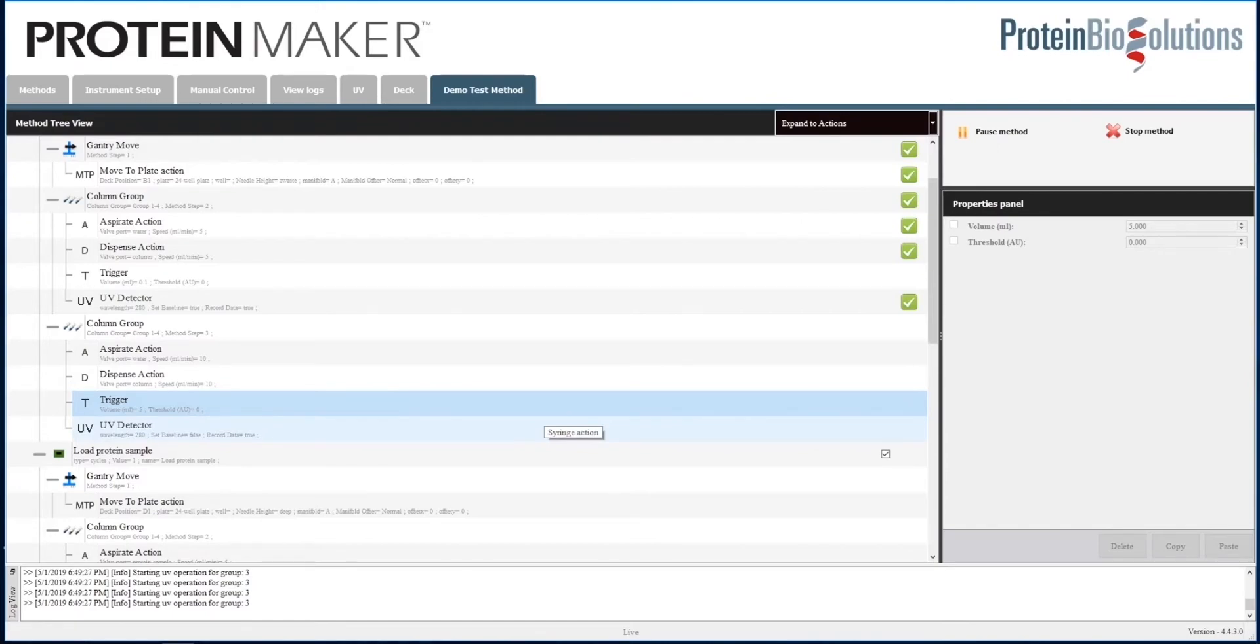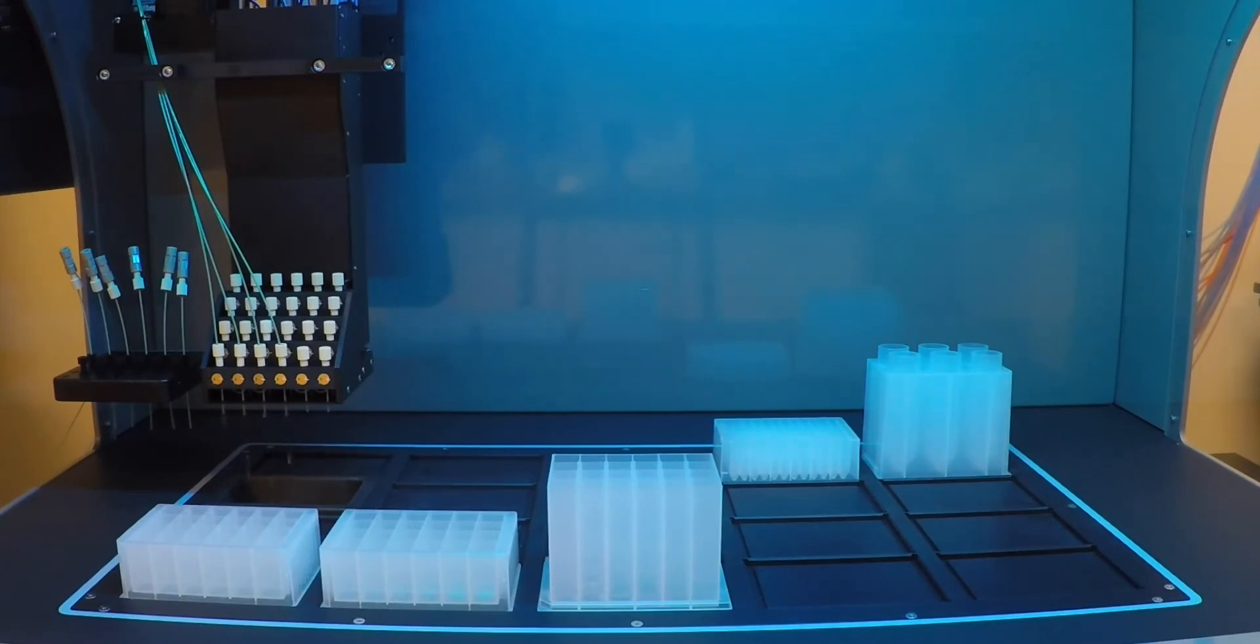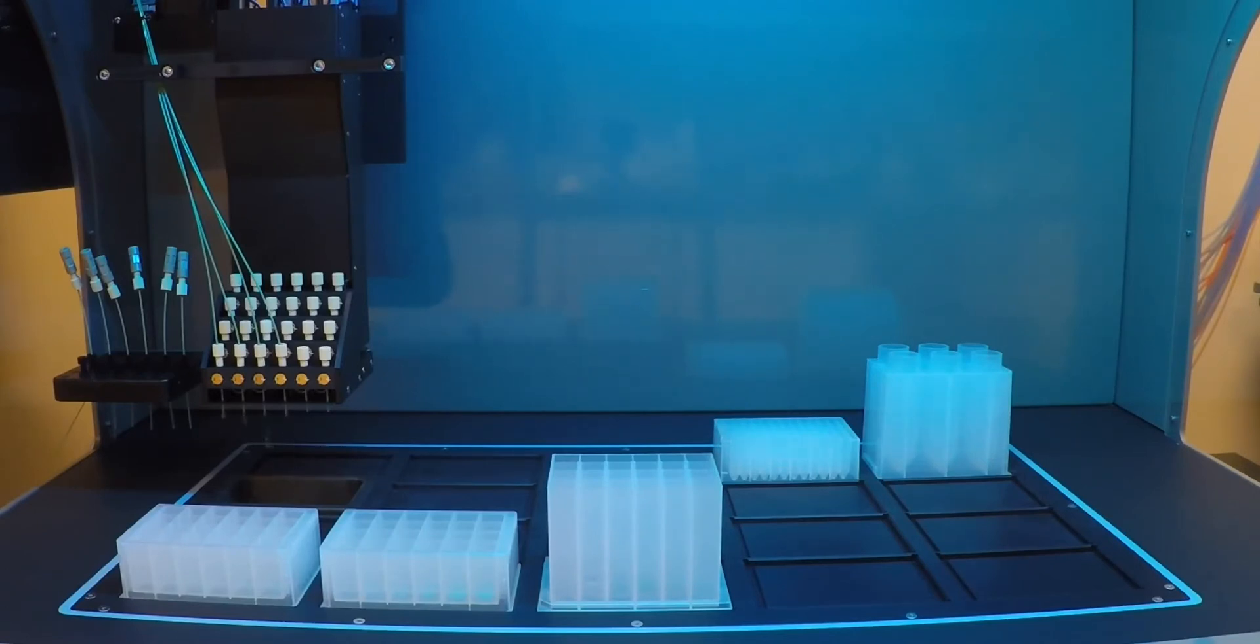So the first thing that's happening in the video of the fraction collection deck is the washing of the column with buffer. You see the fluid dripping out into the waste position. What we've done in the method is programmed a group of columns, 1, 2, 3, and 4, to pull from port 3, where there is wash buffer.